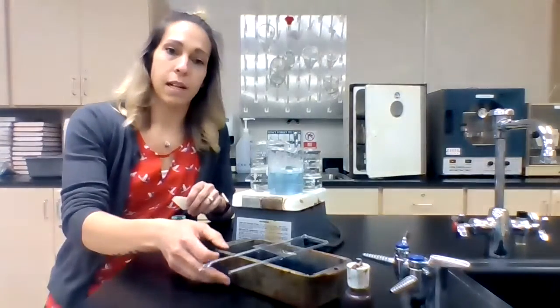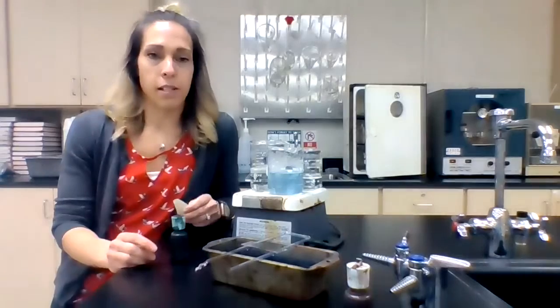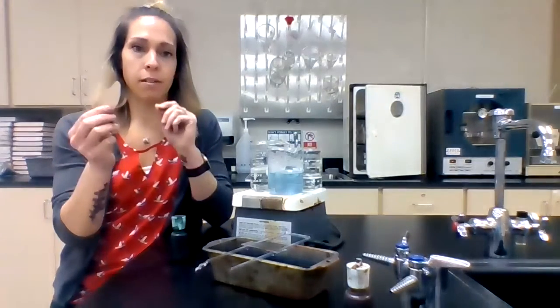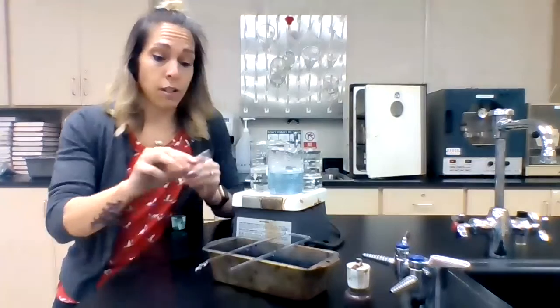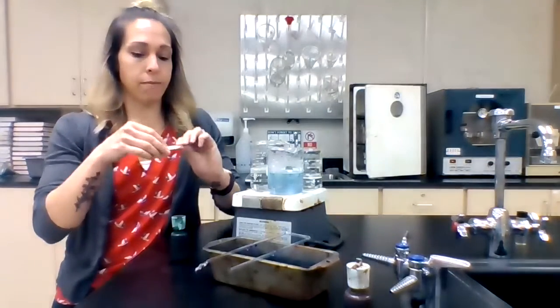Lab staining procedure, we're going to be doing the spore stain. And the spore stain is going to tell us if your bacteria have spores or not. So the first thing you're going to do is take a piece of the brown junky paper towel, the kind that smears all over the lab station and doesn't really help anything. And you're going to place it over the smear that you have dried and heat fixed.